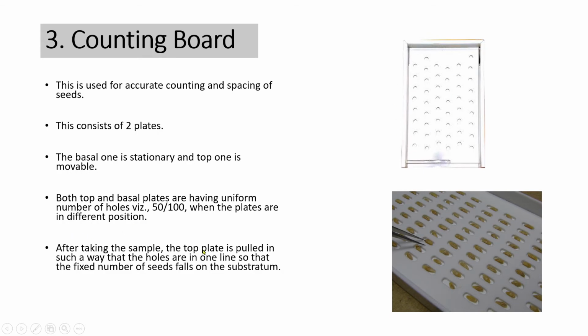After taking the sample, the top plate is pulled in such a way that the holes are in one line, and the fixed number of seeds falls on the substratum. Yes, this is the same principle.